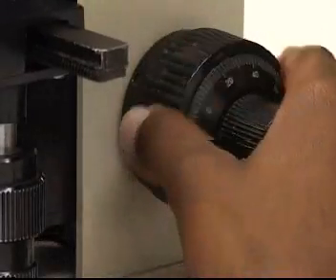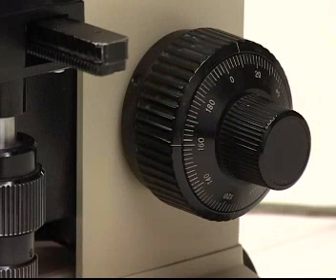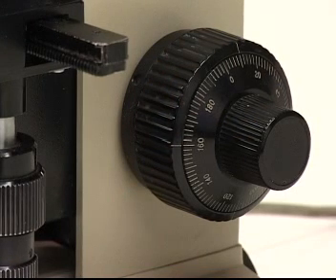It allows the objectives to move closer or further away from the object you wish to study. It is important that you know the functions of the various parts of the microscope. So, I will give you a moment to write down the function of an adjustment screw. Teacher, please see that the students are writing the function down correctly.